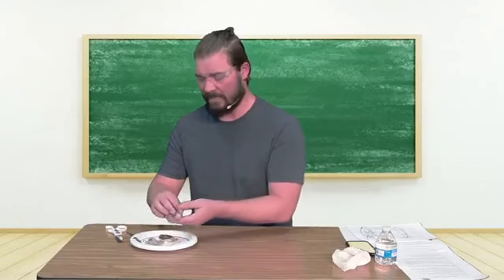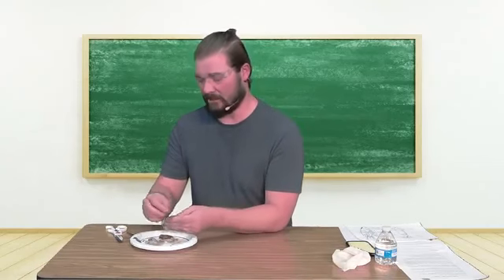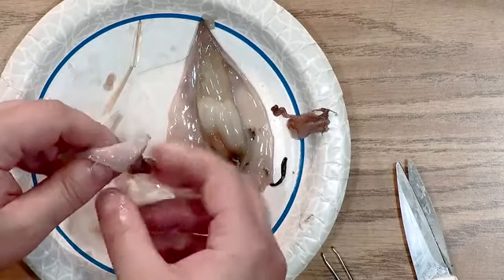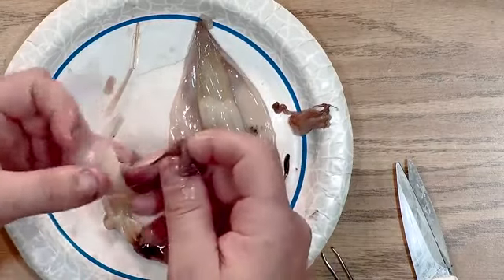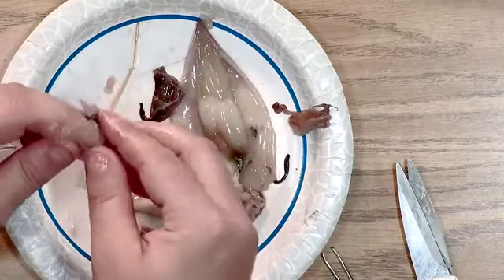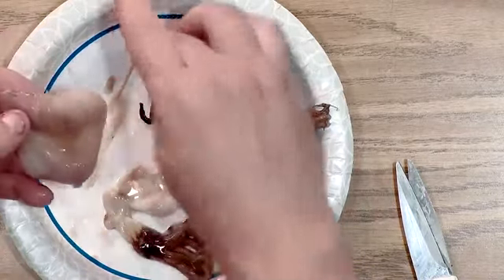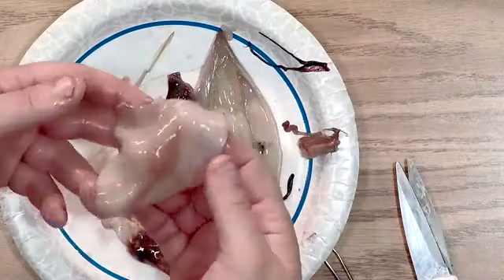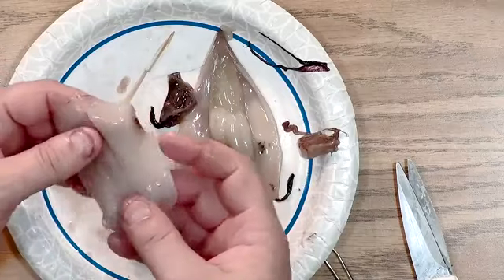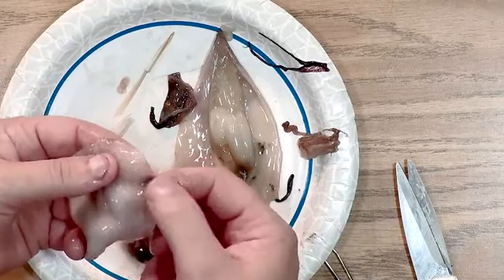All right, so I'm coming back into this, and then I highly suggest taking this, and you can actually separate the fins and the skin here on it from the mantle pretty easily. And now I have got this beautiful kite-like mantle.